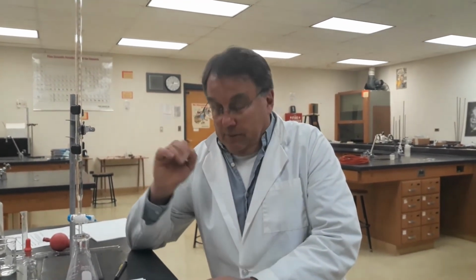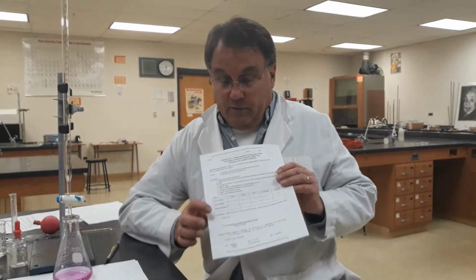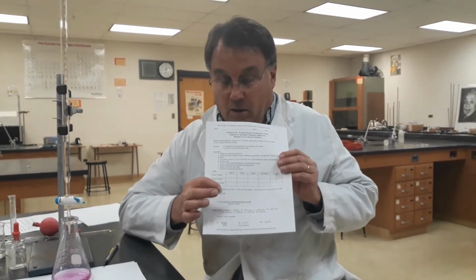All right, so there you have all three readings. By my measure, we have three very alike trials. All the formulas that you need are at the bottom here and on the back in the order that you need them. And I will publish the accepted value for the percentage of that unknown at the end of the day. So good luck if you decide to do this.